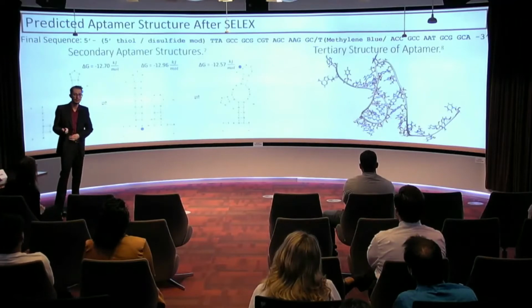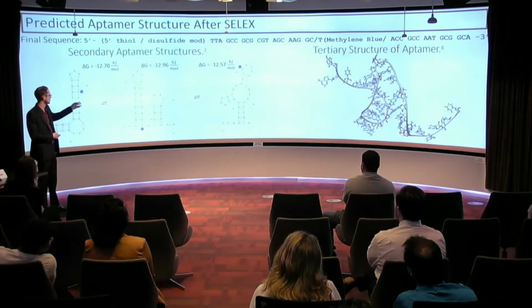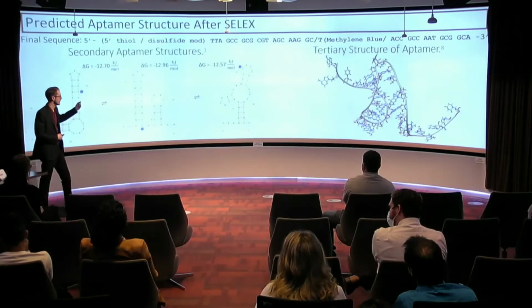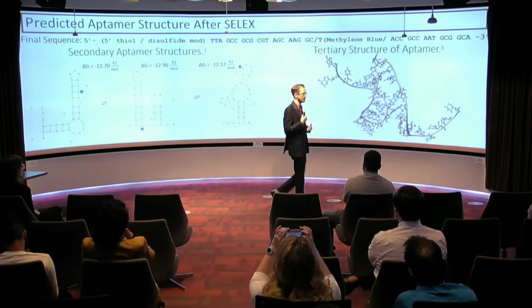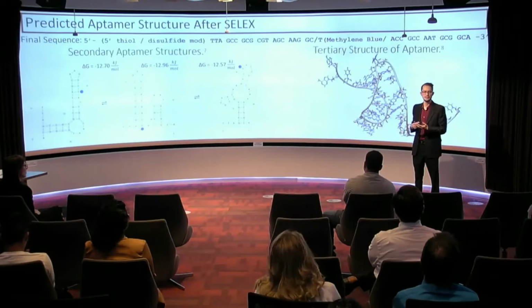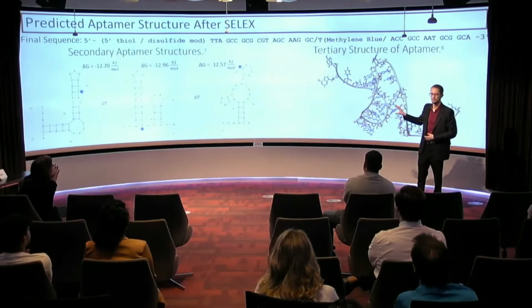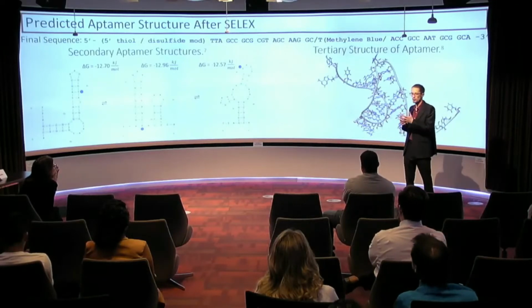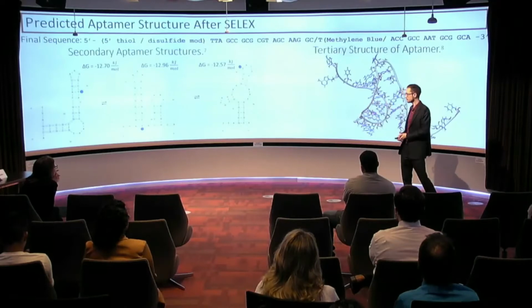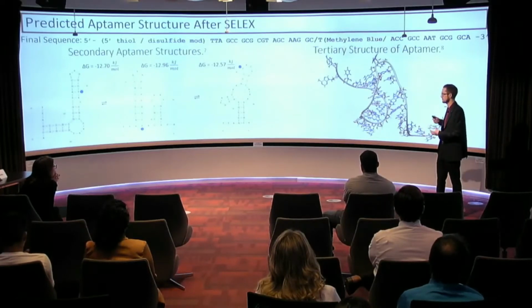So then we use thermodynamic analysis to try to determine the conformations of our DNA aptamer. What you see on your left is 3 different conformations of the exact same sequence of DNA. And those blue dots represent where the methylene blue molecule is appended. And what we see is those delta G values, which is just a term we use for quantifying the energetics of the system, are all very similar. So these 3 conformations would exist in equilibrium, meaning they exist in roughly the same concentrations in a solution without GPL. But when we add GPL, essentially only one of those 3 conformations will predominantly exist, causing the overall electrical current to be different. Because before we were taking an average of those 3 positions, and now we're just taking one of those positions, so the current will be different. And then over here on the right is a tertiary, or 3-dimensional, structure of, it's actually an RNA analog, but it should be very similar to how our DNA looks in 3 dimensions.